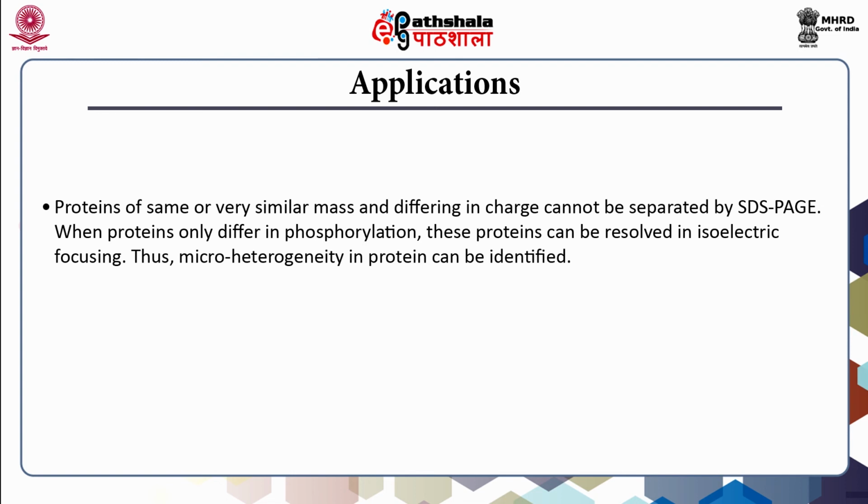Thus, the technique can be used for identification of microheterogeneity in protein. Isoenzymes differing in their isoelectric point can be identified. This can be achieved in two ways.